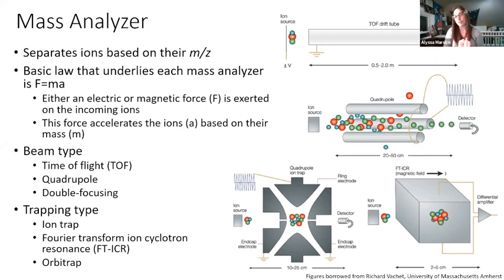There isn't just one molecule of cocaine in that sample. Remember back in your Gen Chem days, Avogadro's number? If you have a fraction of a mole of a sample, you're going to have a huge number of molecules in that sample. All of these molecules of cocaine are going into the instrument. Some of them maybe stay intact: they don't get a lot of energy, they get ionized, and stay as the full cocaine molecule. Maybe some of them get bombarded with a bunch of electrons and part of the cocaine molecule breaks in half. So we get a different distribution, whether it's fragments or a full cocaine molecule. All of this goes into the mass analyzer, and the mass analyzer separates it based on its mass.